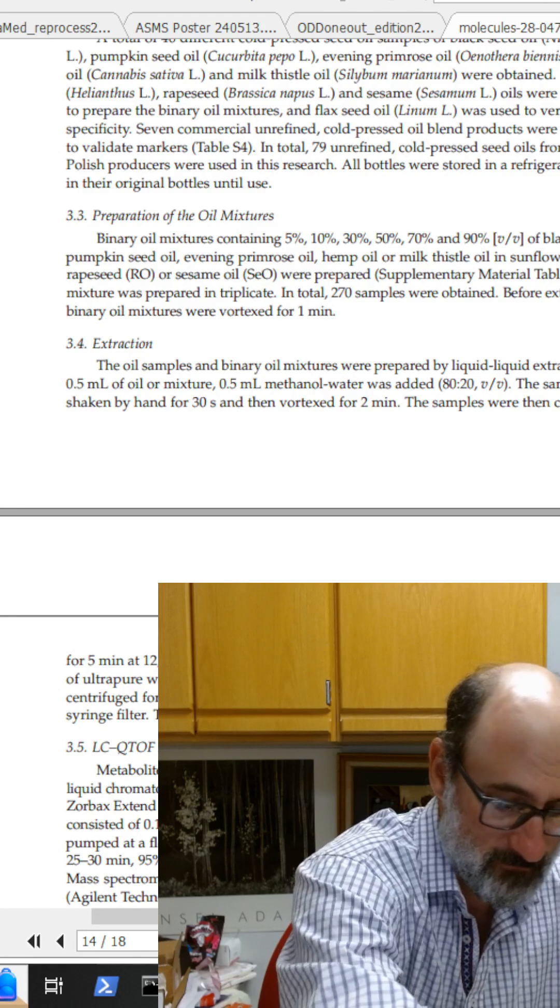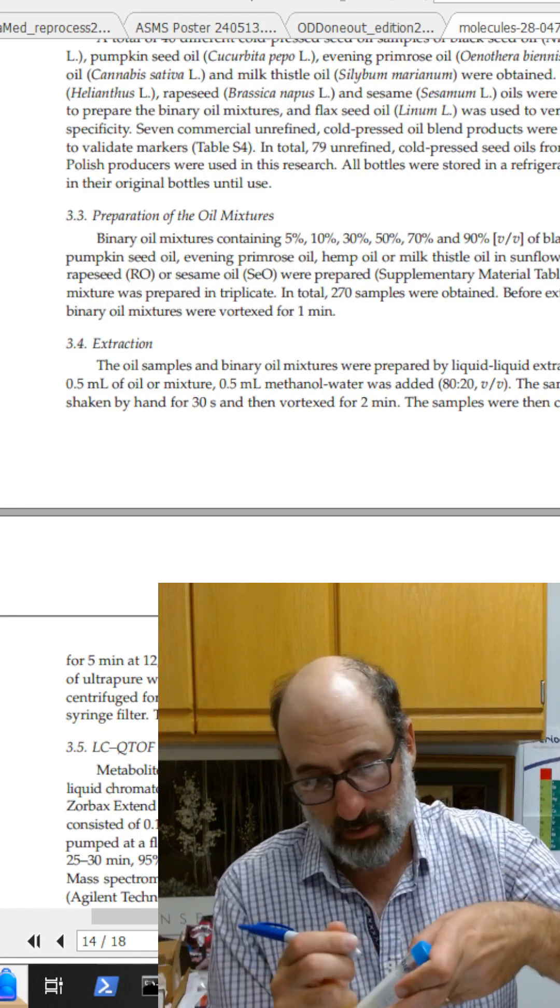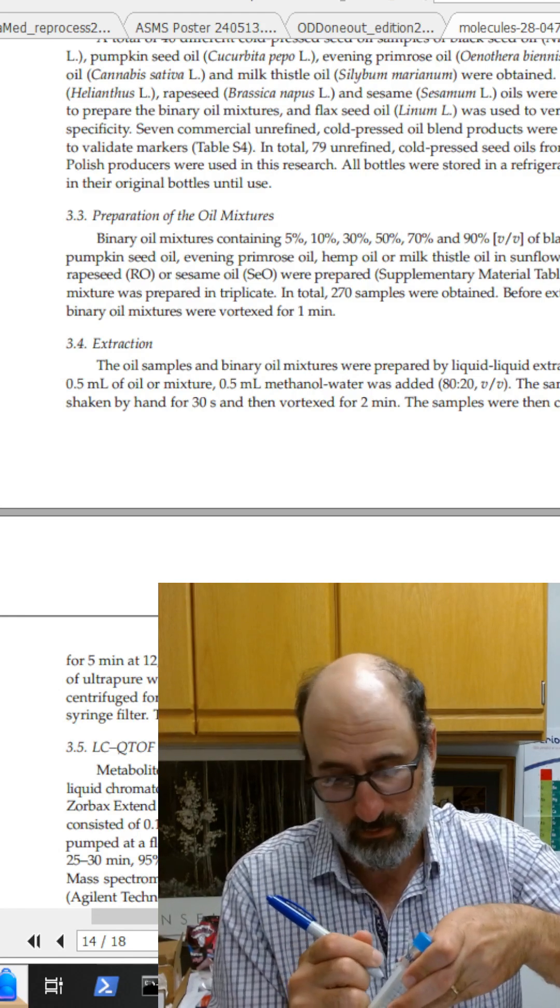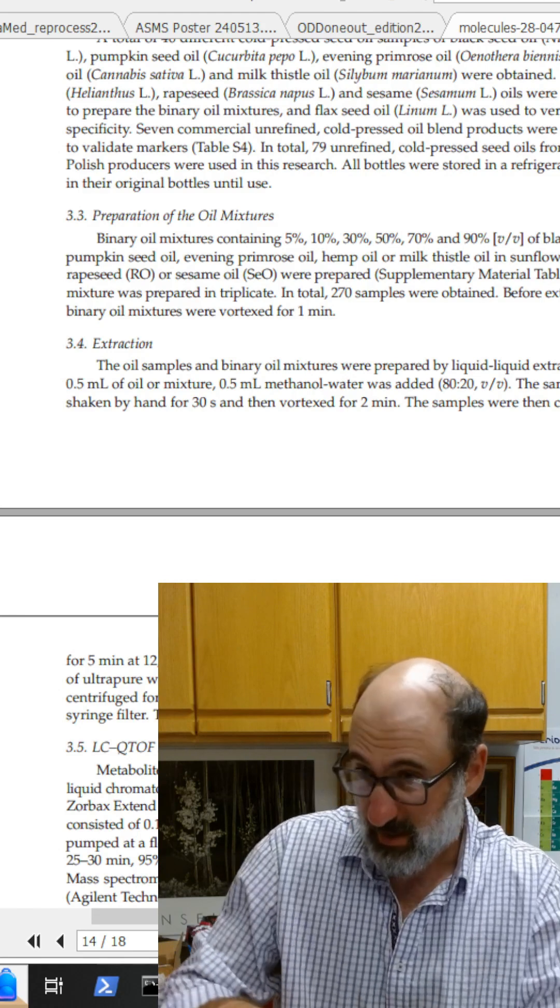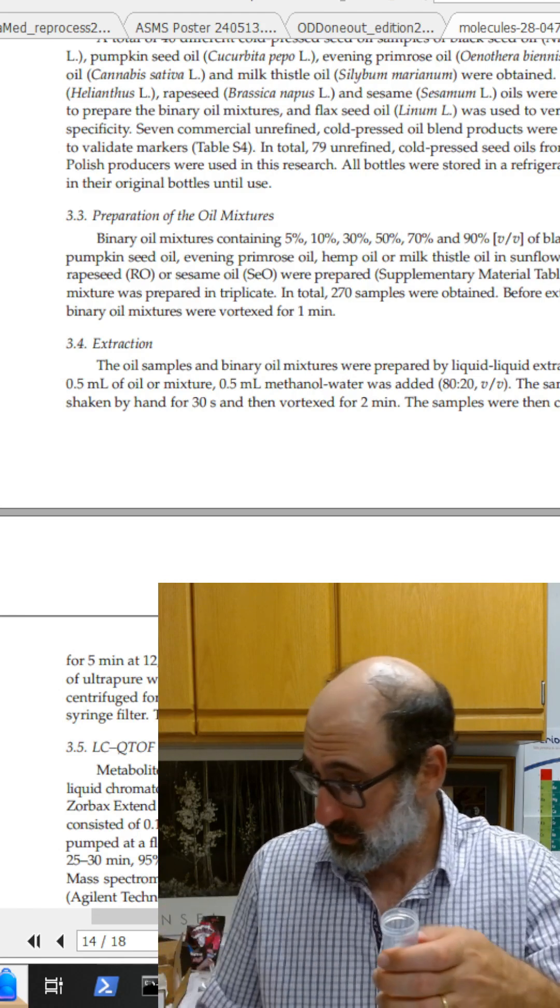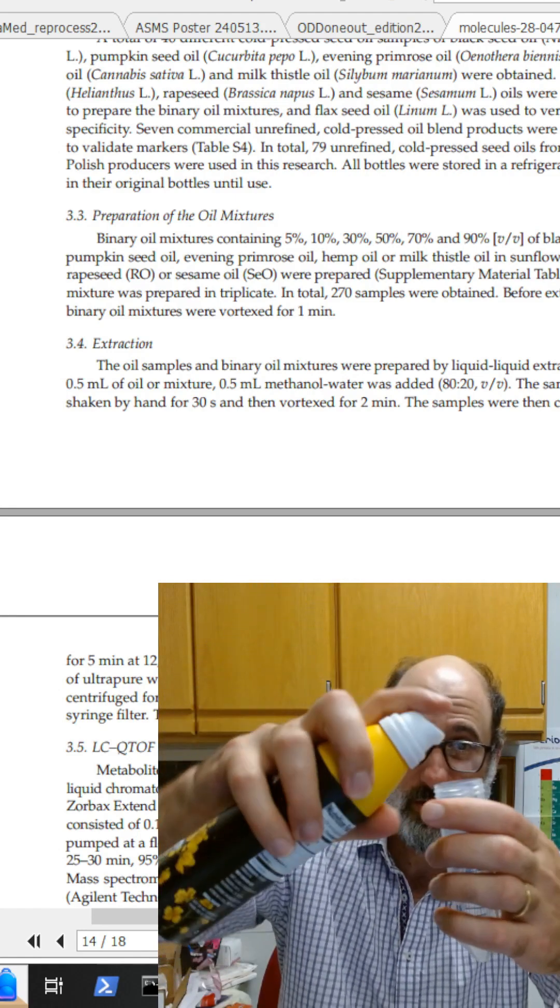I'm going to put that into my rack. And then, as everybody can see, it's right out of the container. This is the canola oil spray. Again, hopefully I don't get it on my desk.